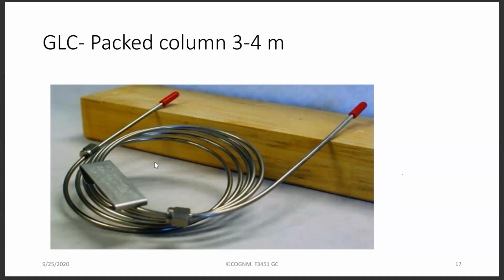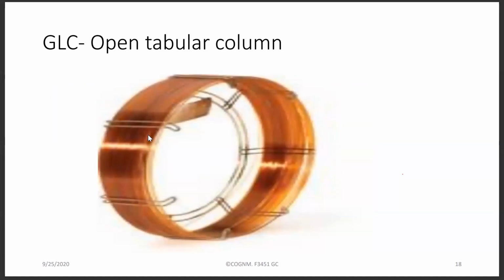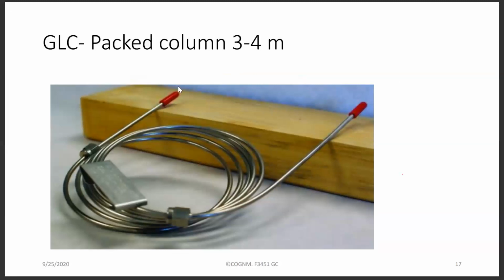So they usually just, and then now they can be up to 50 meters. So that's a long one. Just think about it. This is a clearer picture you can see moving along. So just take note. Let's assume one side is close to the injector, and one side is close to the detector.